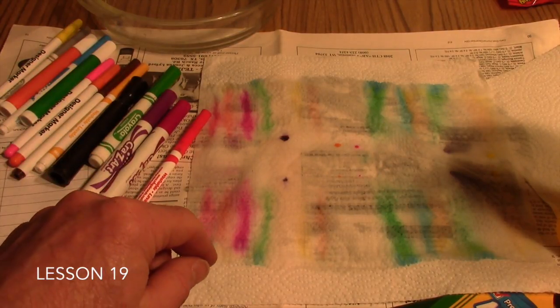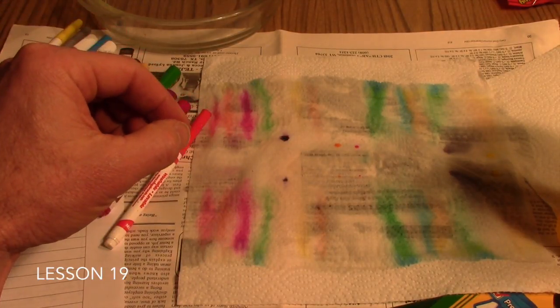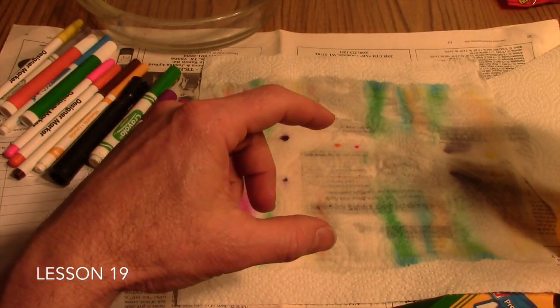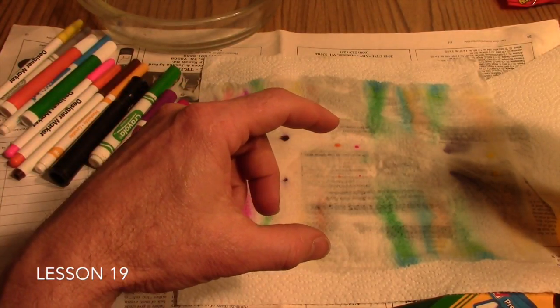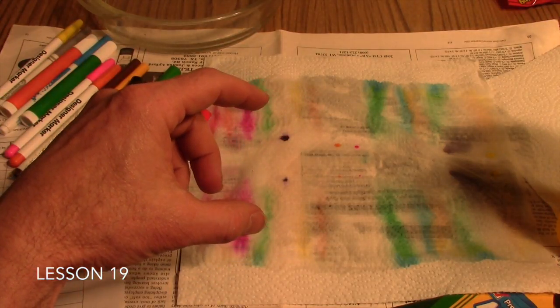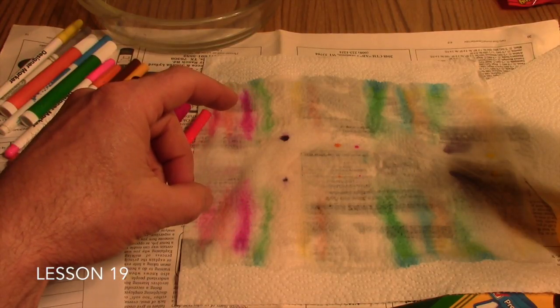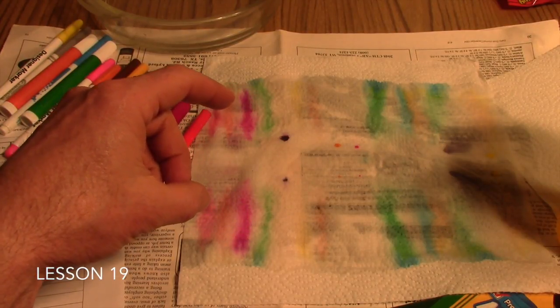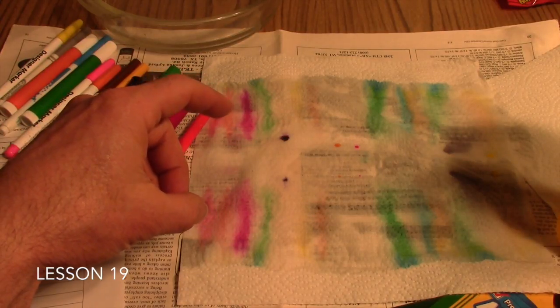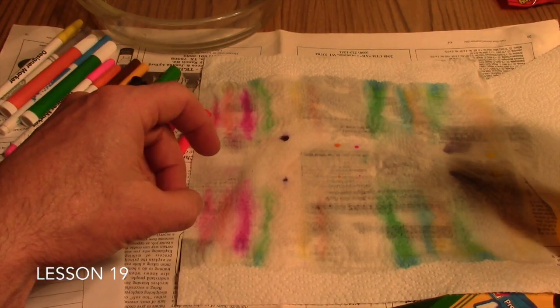An extension of this activity that's included in your teacher edition, there are instructions on how to repeat this process using plant pigments. And to prepare those plant pigments, you'll take leaves and petals of various colored plants around your yard, or if you go down to the local plant shop or a florist, many times they'll have flowers that they're discarding or foliage that's no longer useful for them. And so you can dig in their trash cans and get all different colors of petals and leaves.